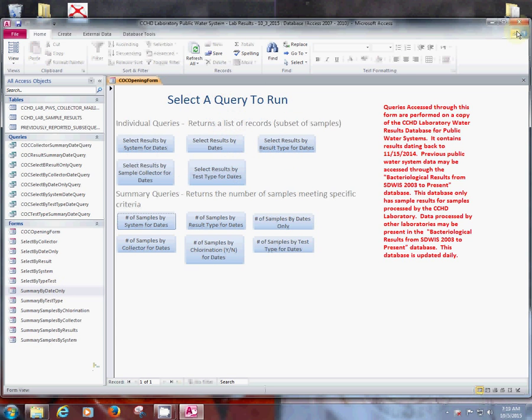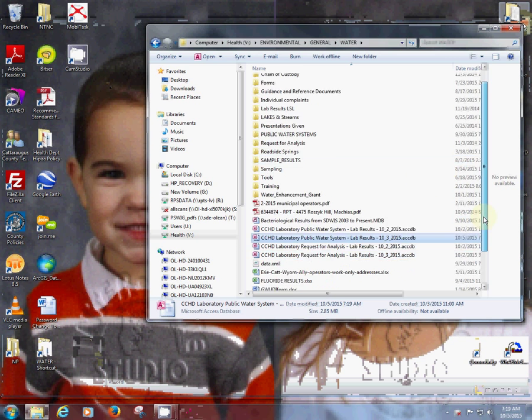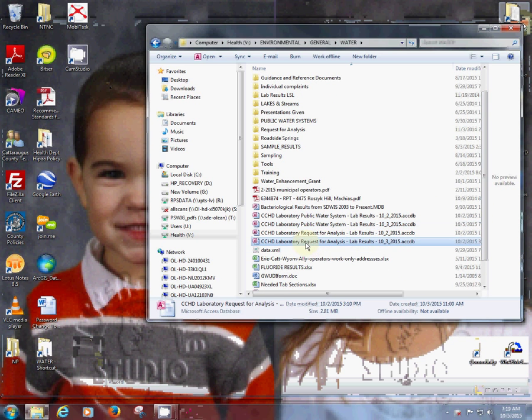Alright, excellent. So those are the queries for your public water systems. Let's close those up, and hopefully I'll fix that little issue there. Now let's look for a request for analysis.